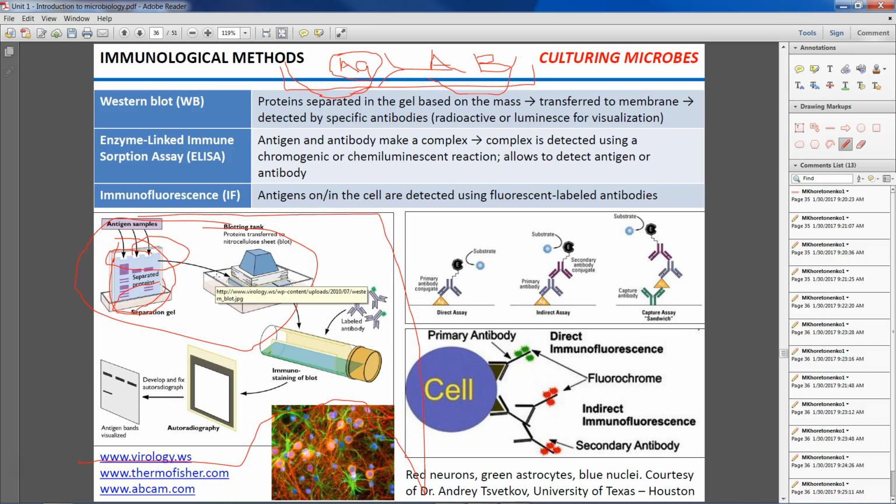Well, good, but what you're going to do with that next? Gel is extremely inconvenient to work with. It's a gel. It's like working with Jello. So next step would be to move those proteins after they get separated from the gel to a special membrane. You can see the blue membrane right here. Gel and membrane are aligned against each other, pretty much. Electricity again is applied to that system, and proteins move from gel to the membrane.